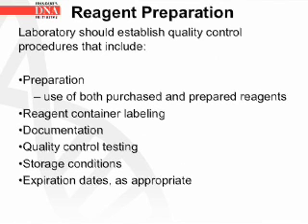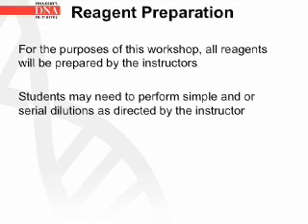Reagent preparation is a very important part of the laboratory screening process. A laboratory should establish quality control procedures that include preparation, use of both purchased and prepared reagents, reagent container labeling, documentation, quality control testing, storage conditions, and expiration dates as appropriate. For the purposes of this workshop, all reagents will be prepared by the instructors. Students may need to perform simple and/or serial dilutions as directed by the instructor.